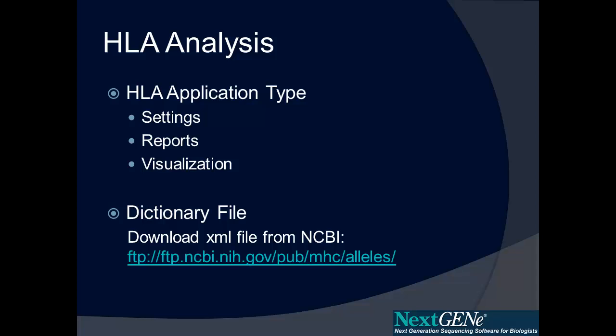The HLA typing works by using a dictionary file that includes the sequences of known HLA alleles. This file can be downloaded in XML format from NCBI.